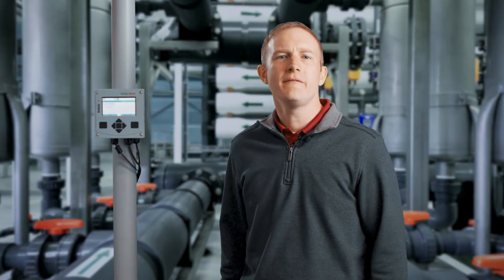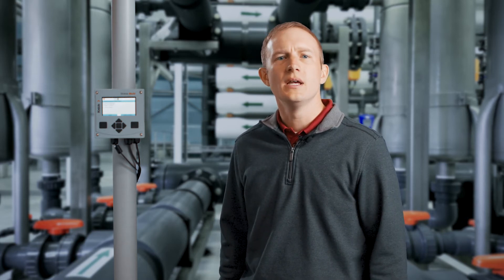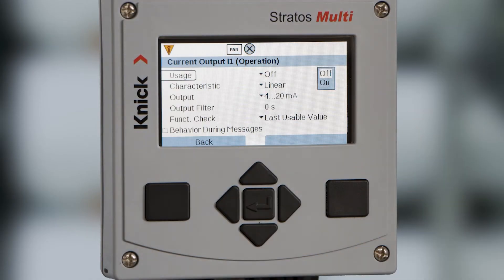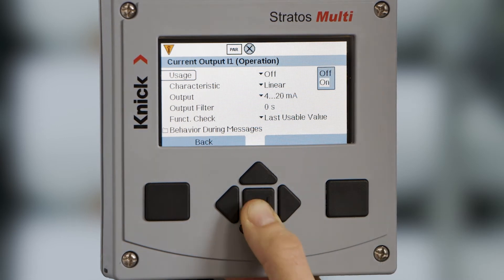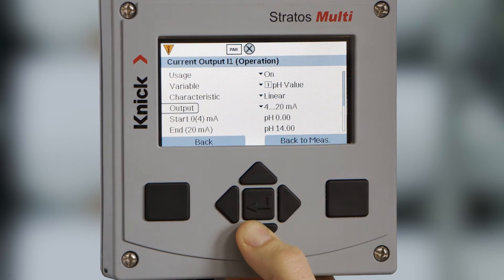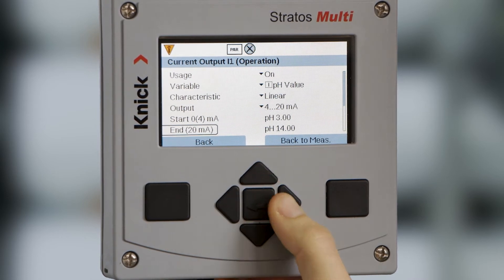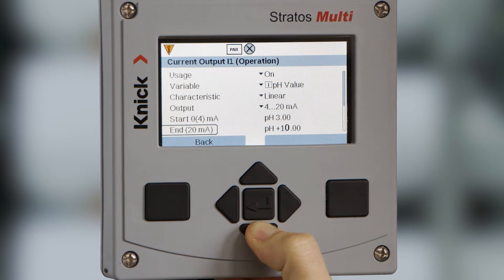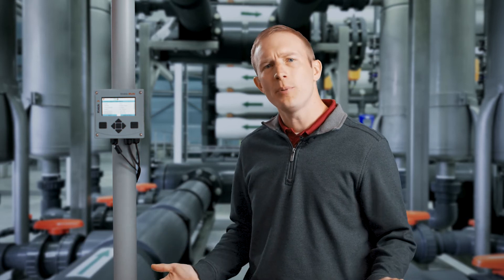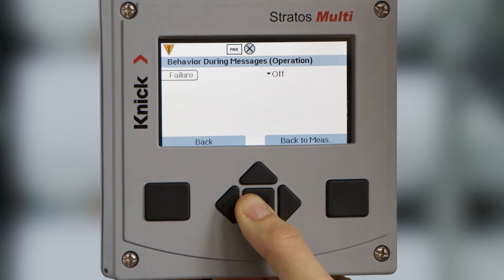For this transmitter, we will configure two 4 to 20 milliamp outputs — one for pH and one for conductivity — as well as one high level pH relay. As you can see, the output can be turned off if not in use. We will turn output 1 on and configure it for a pH value from 3 pH to 10. Lastly, we can define the milliamp output of the device when in failure mode to be either 3.6 milliamp or 22 milliamp. This can be done in the behavior during messages folder.